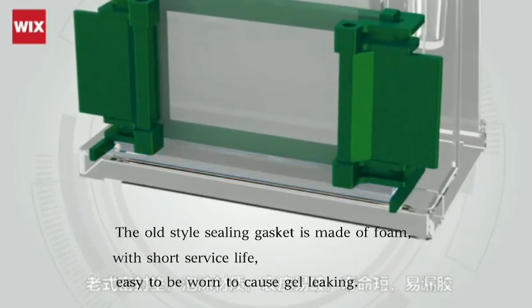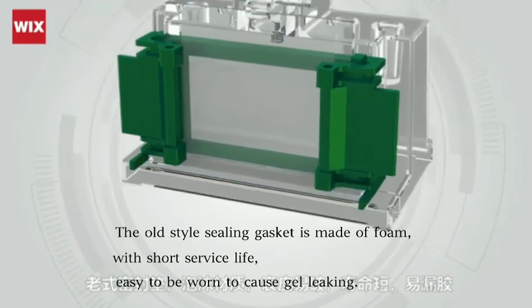The old-style gasket is made of foam, has a short service life, and is easy to wear out, causing gel leak.